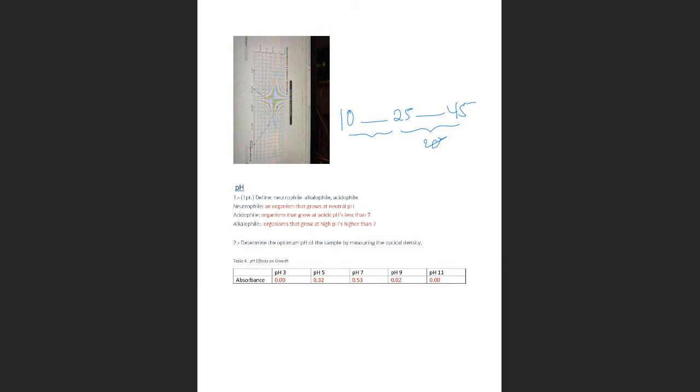Except one thing here, though. This is just 10 degrees. However, was it tested at 5 degrees? Because if it was, and it was no growth, then yeah, this is definitely weird. But if it wasn't tested, then you don't know whether it would have grown at 5. Maybe it did. So you don't know how low it was able to go. I would have to take a look at the results and see exactly what went wrong.